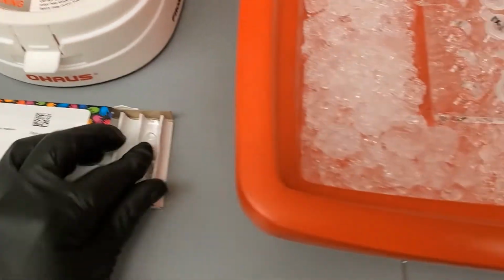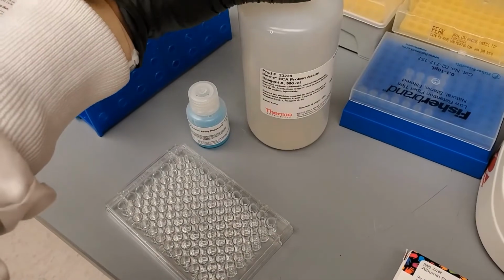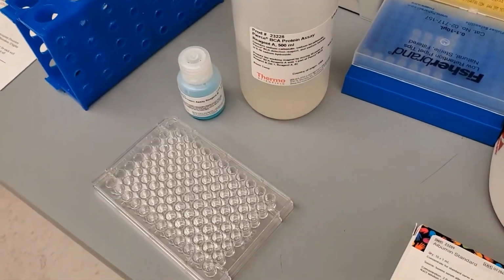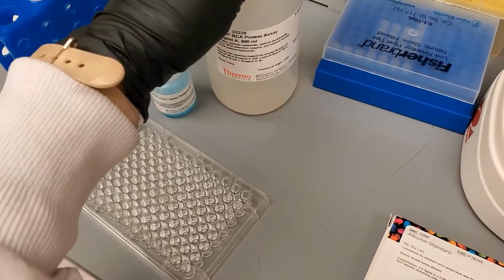Okay, so I'm going to start loading my samples. I'm going to go ahead and get my reagents A and B ready. And once again, we dilute this 1:50 into our reagent A.